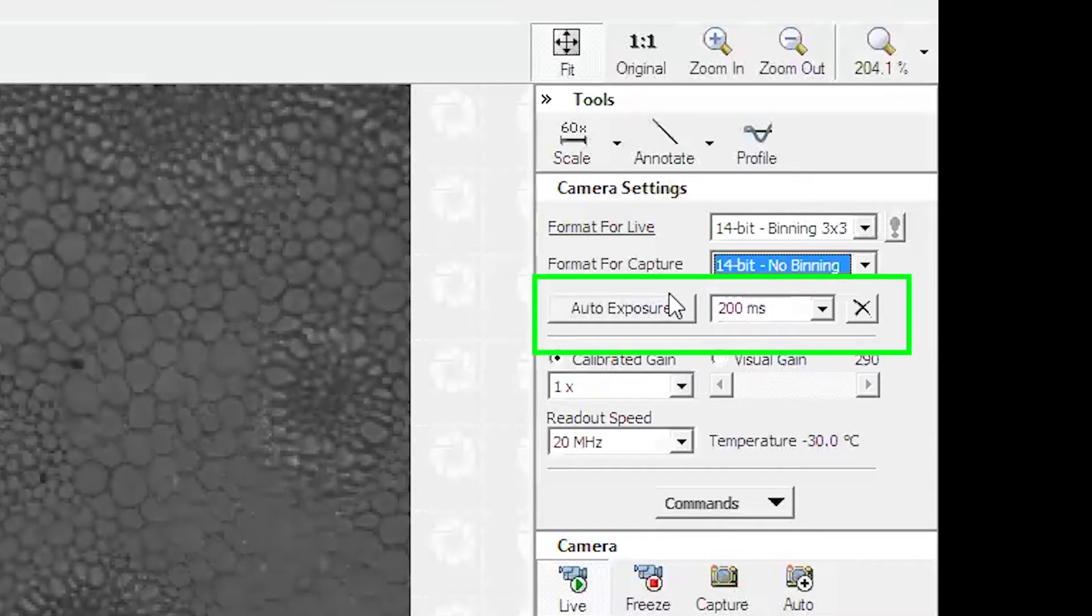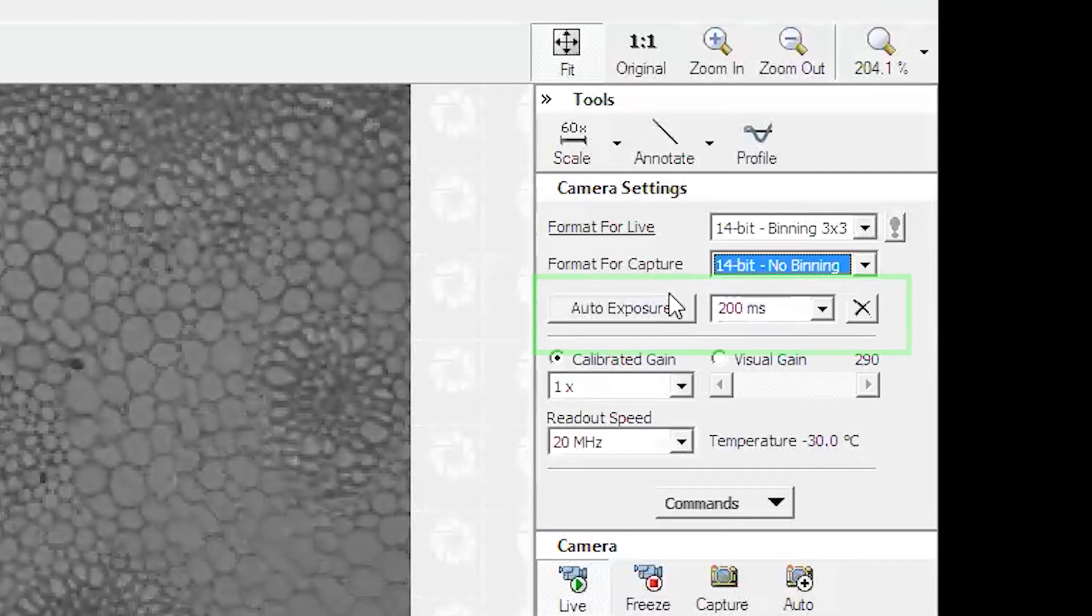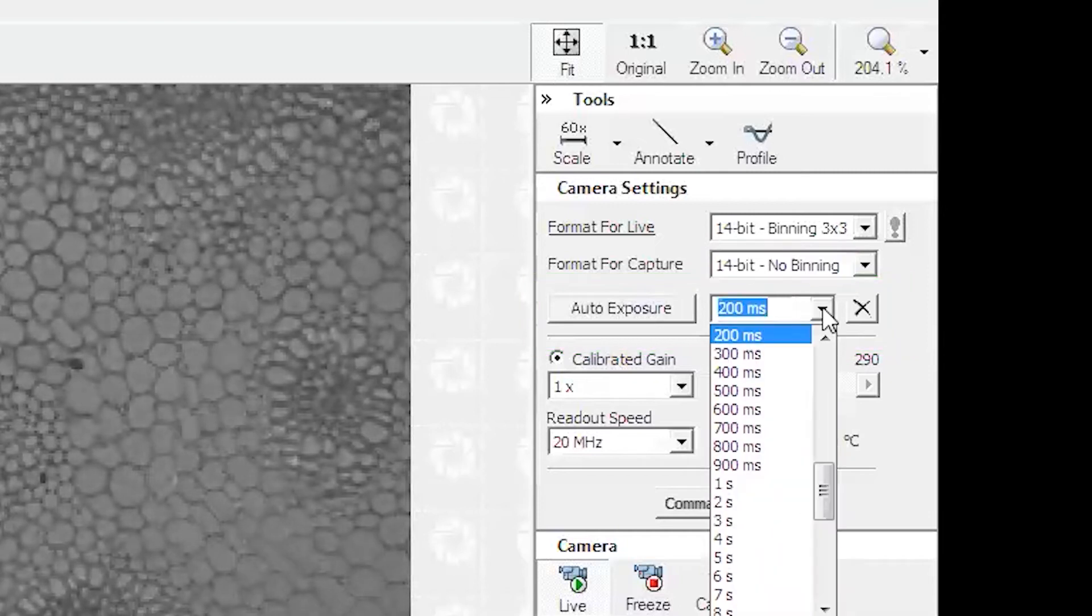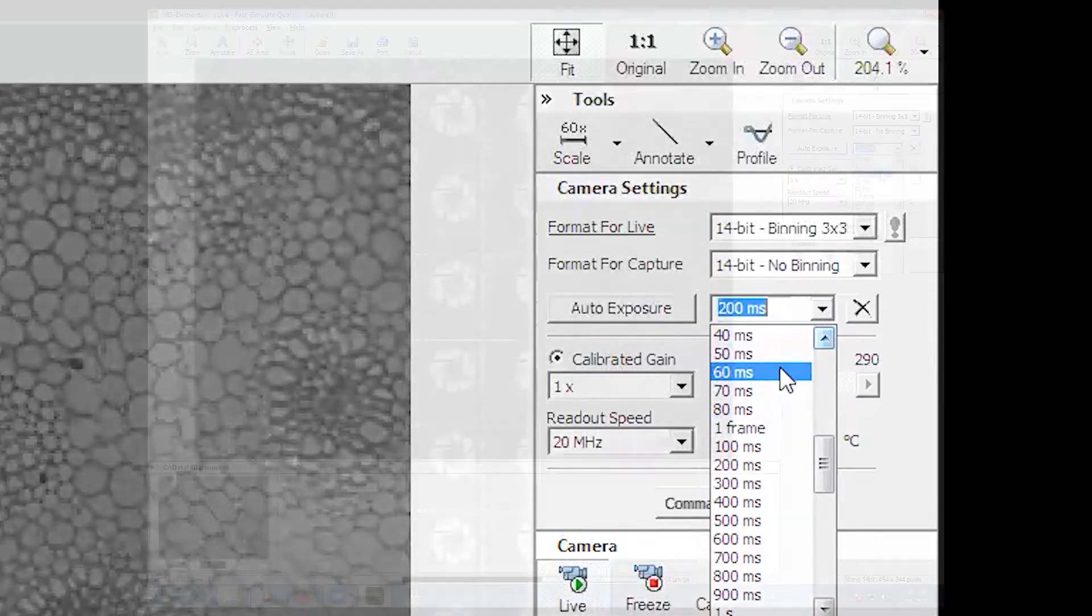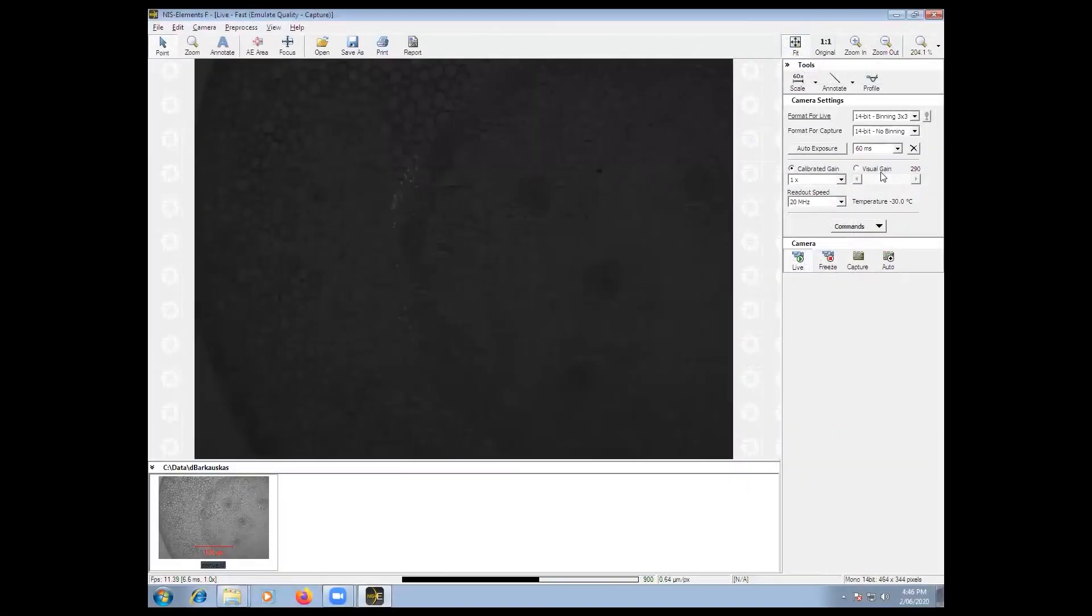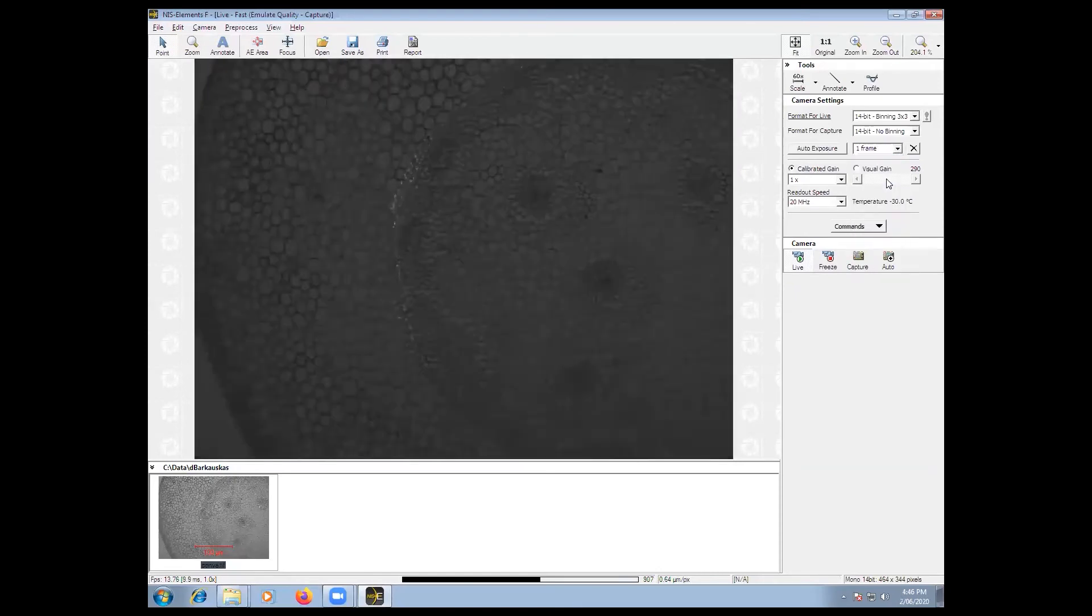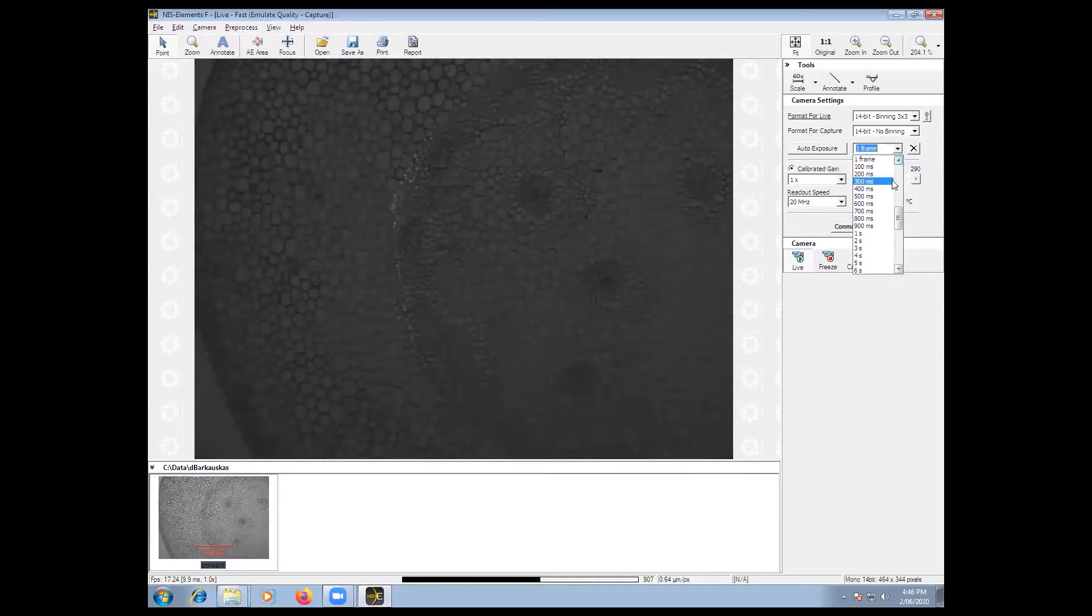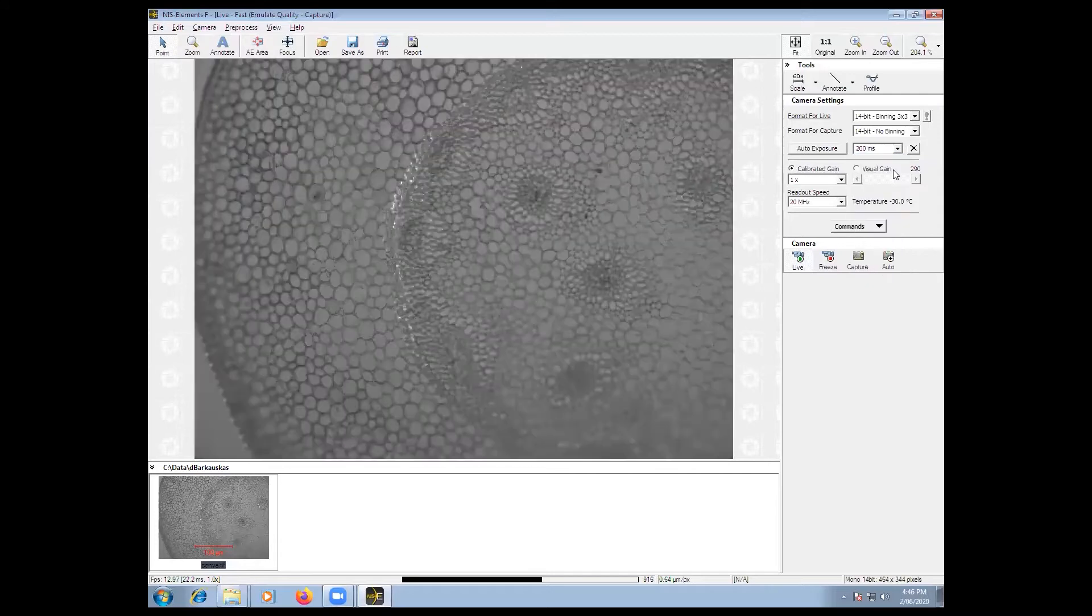Exposure time is the time that your camera is detecting photons from your sample. You will see in the drop down box a one frame selection which shows you the speed limit of your camera. If you select an exposure time lower than this one frame, you will find that the image will not be collected correctly. Adjust the exposure time to get a good contrast in your image.